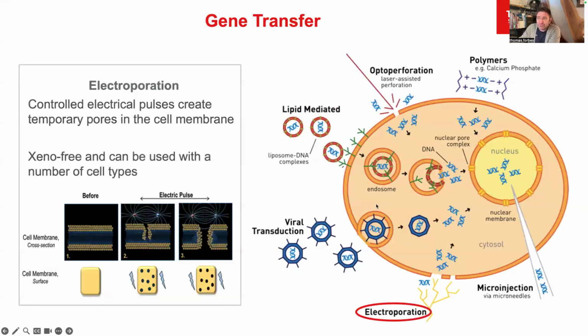We also do rely quite heavily at Thermo on the process of electroporation, which I've circled down here at the bottom.